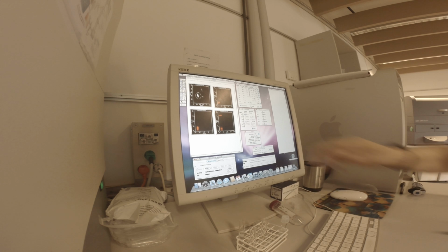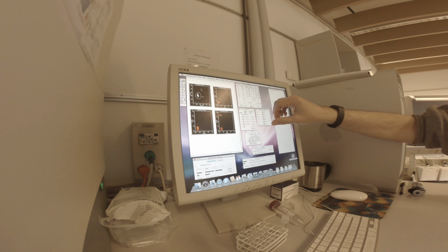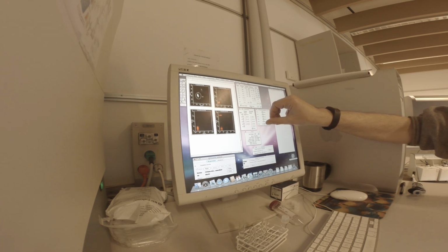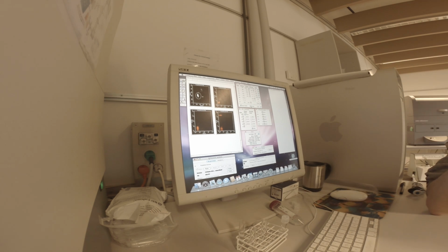Okay. That one. So you can actually tell the shape of the peaks as well if you know what you're doing. So the tail on the right is much bigger, always? Yes. So it's always low, high, low, high, low, high in numbers. So like 1, 15, 1, 15, 1, 15. Okay. More or less. Yeah.